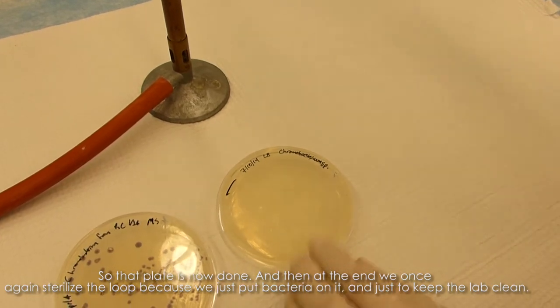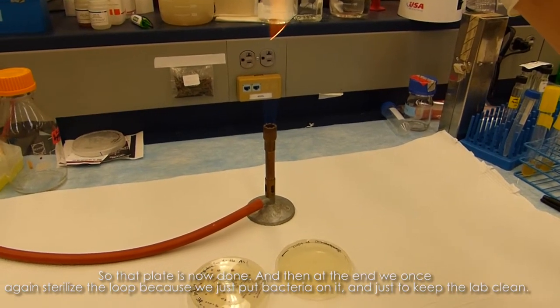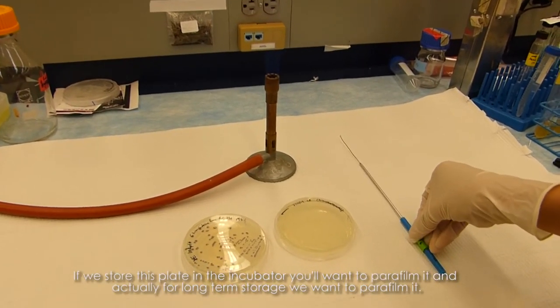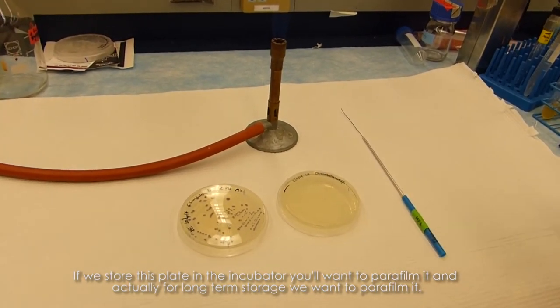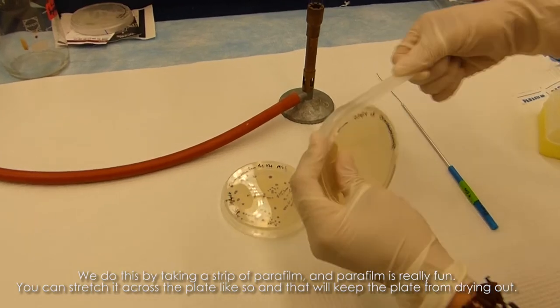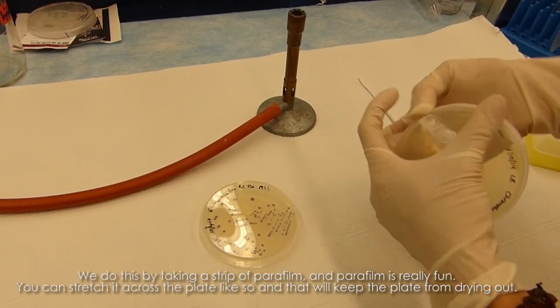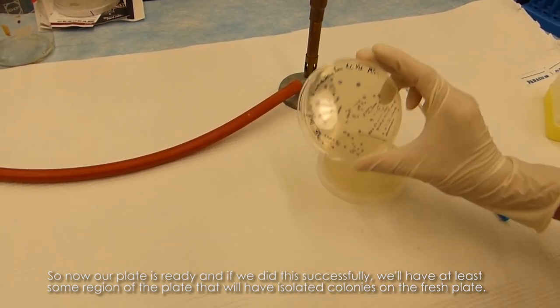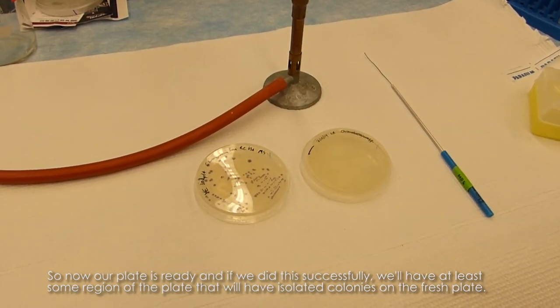That plate is now done. At the end, we once again sterilize the loop because we just put bacteria on it — just to keep the lab clean. If we store this plate in the incubator, or for long-term storage, we'll want to parafilm it. We do this by taking a strip of parafilm and stretching it across the plate, which will keep the plate from drying out. Now our plate is ready, and if we did this successfully, we'll have at least some region of the plate with isolated colonies on the fresh plate.